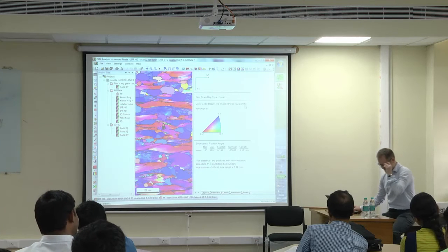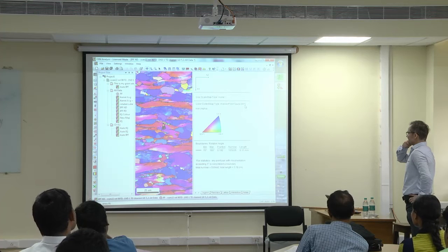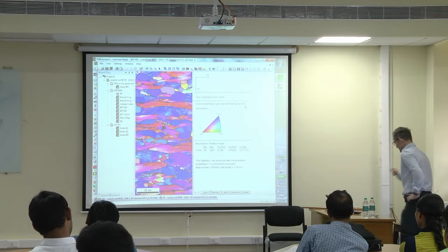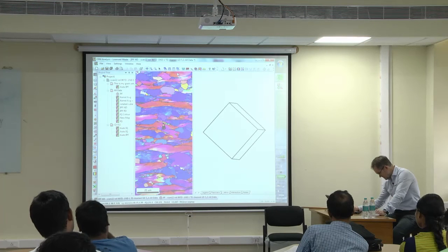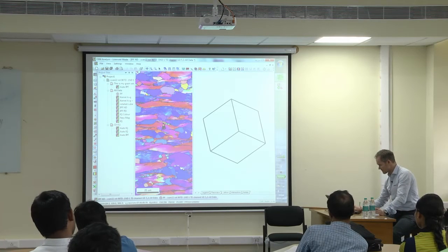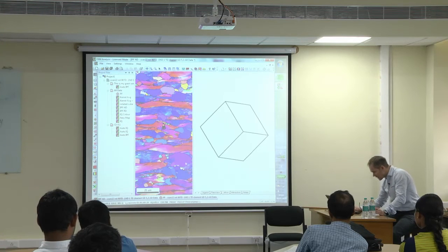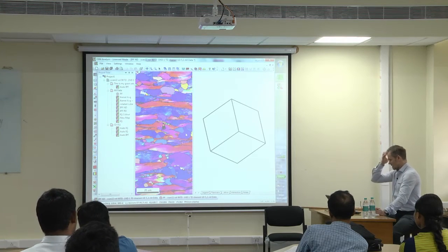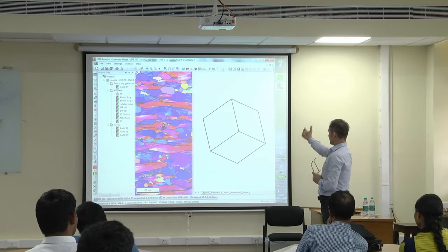Let me see. 001. Even I am confused now a little bit. Is it really like that? Lattice. Yeah, it's clear. You see when I'm touching a red grain, I'm always seeing the 001 plane. When I'm touching a blue grain, I'm always looking on the corner of that grain. And unfortunately there is no green grain, which we could try, but red and blue is there, so that's very clear. That means in colors, I'm showing the orientation which points out here.